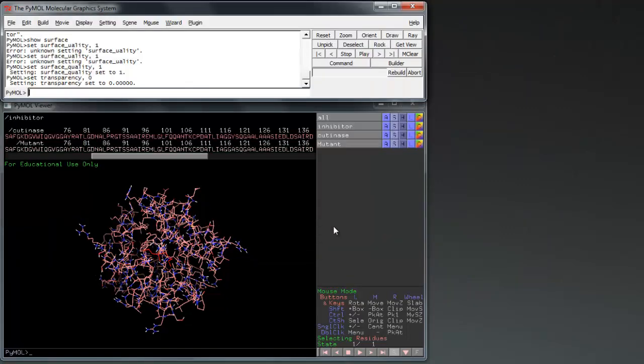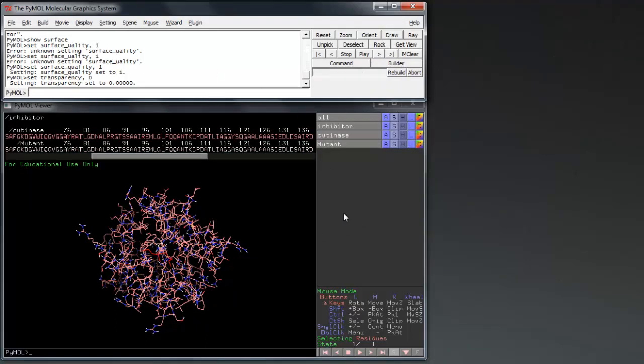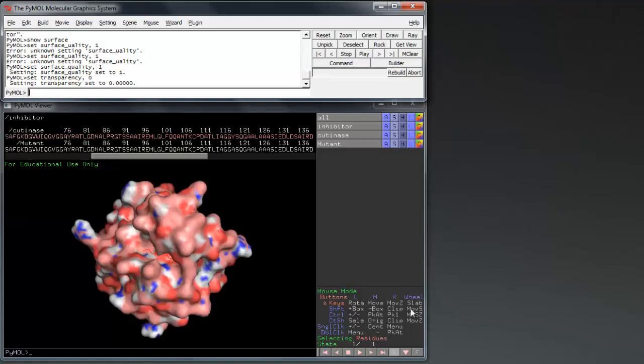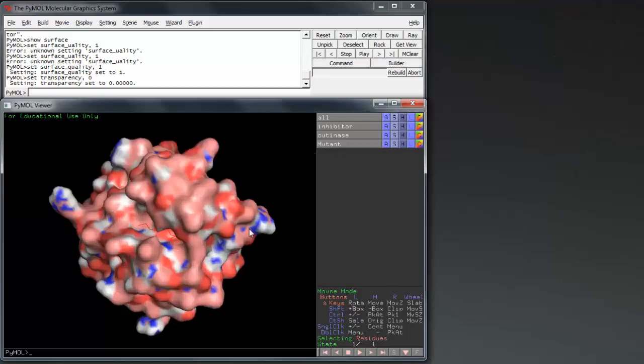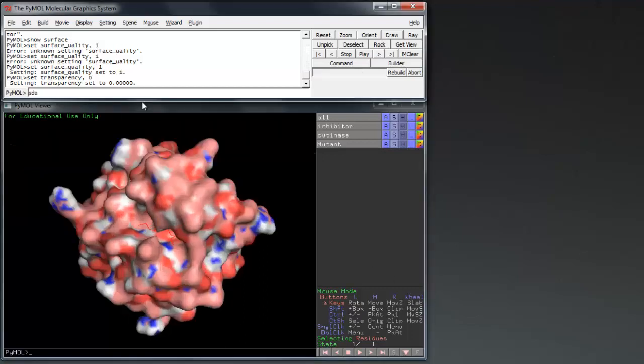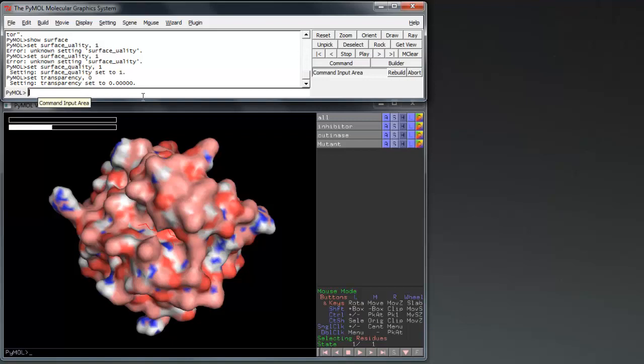We want to see the physical effect of our mutation on the overall structure of the protein and its active site. To do this, we need to show the surface for both proteins using the Show Surface command before increasing the surface quality by using the Set Surface Quality command.